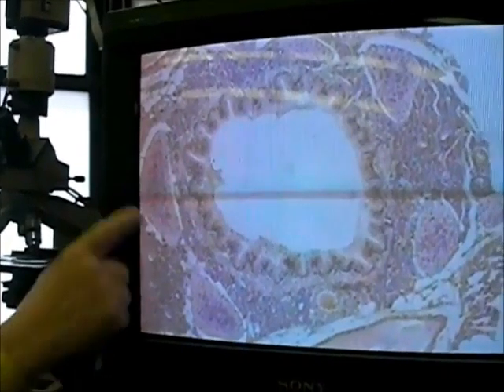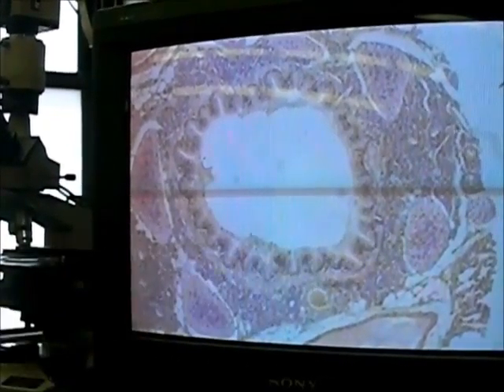So you know that's an air pipe, and you can see the walls of the air pipes are different. You also notice that this is a good sample of another kind of tissue. I could use the lung as a sample of cartilage. So what kind of cells are those? Chondrocytes. That's cartilage. That's a chapter 16 question.